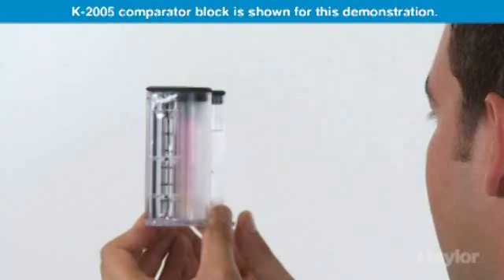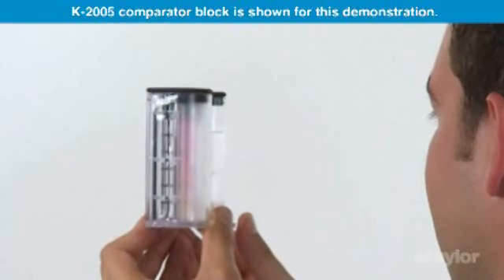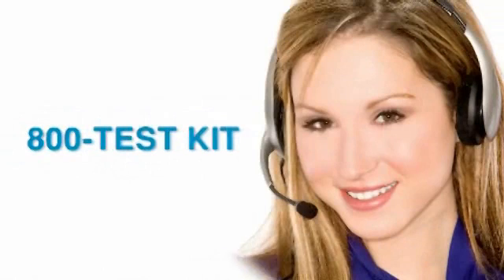Read the tube at liquid level on the back of the comparator block. Record the reading as parts per million cyanuric acid. Taylor's knowledgeable customer service representatives are available to provide technical assistance about our products. Call 800-TEST-KIT.